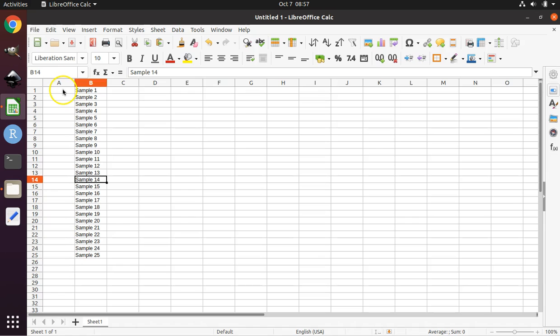The next thing we need to do is have a column of numbers. I don't know why the SAMOVA format requires the file to have this sequence of numbers in the far left column, but it does. So we'll just simply go ahead and do it. So here's the fastest way to do it. I'll type in the number 1, and then underneath it, I'll type in the number 2.